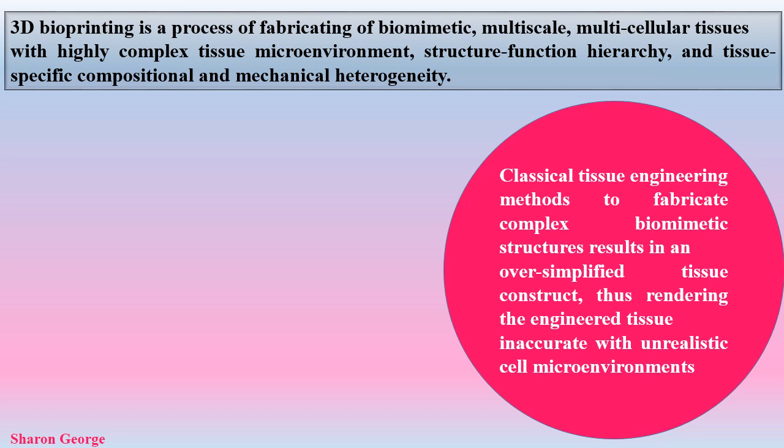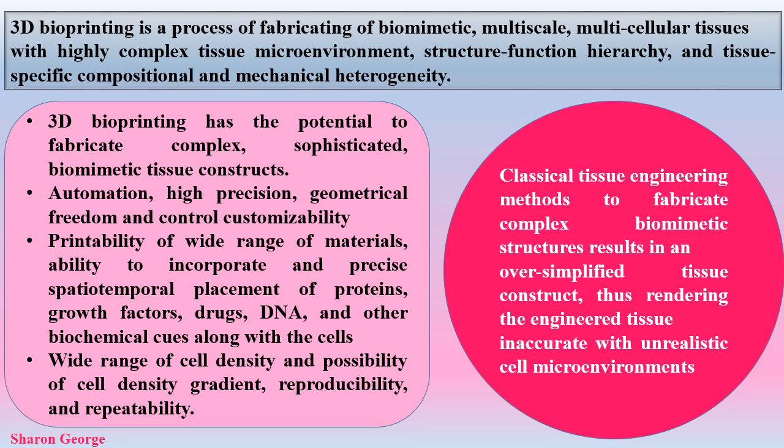complex, sophisticated biomimetic tissue constructs, high precision, geometrical freedom and control, customizability, printability of a wide range of materials, ability to incorporate and precisely place, spatio-temporally, proteins, growth factors, drugs, DNA and other biochemicals, a wide range of cell density and the possibility of a cell density gradient, reproducibility, and finally repeatability. So these are the advantages of 3D bioprinting.